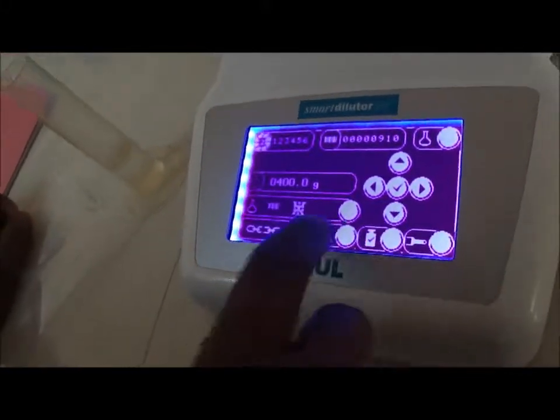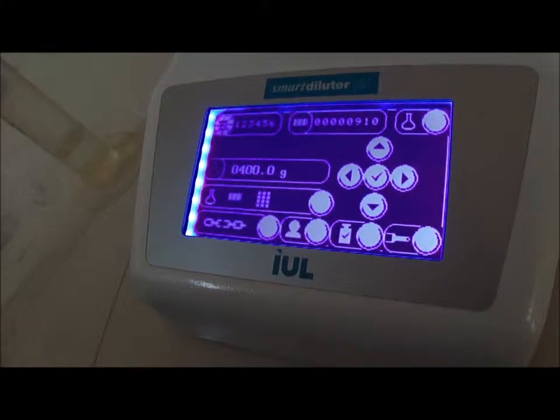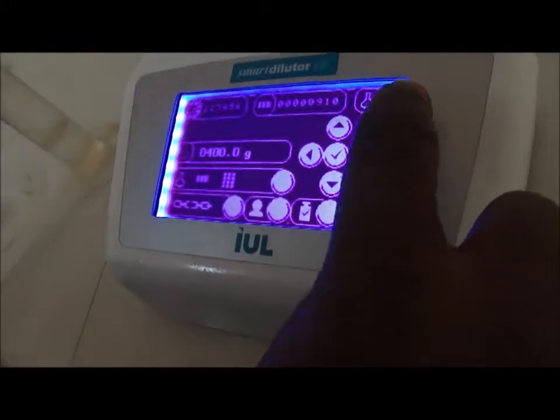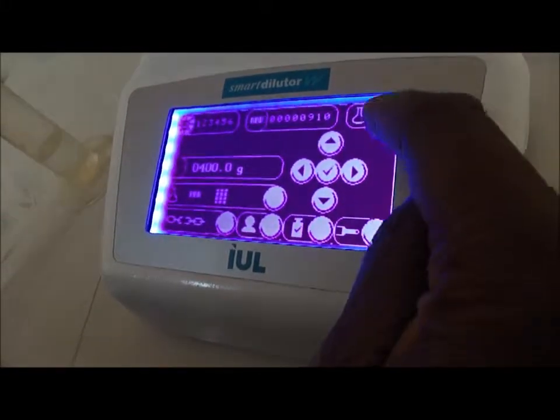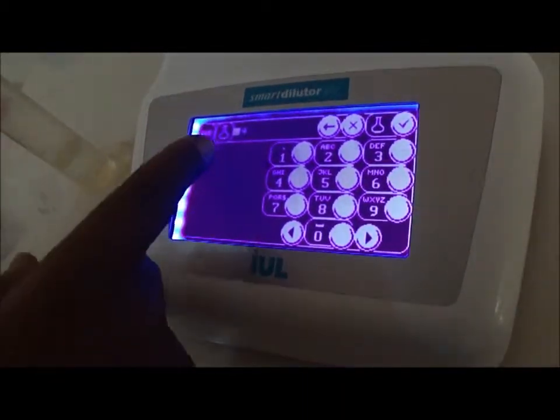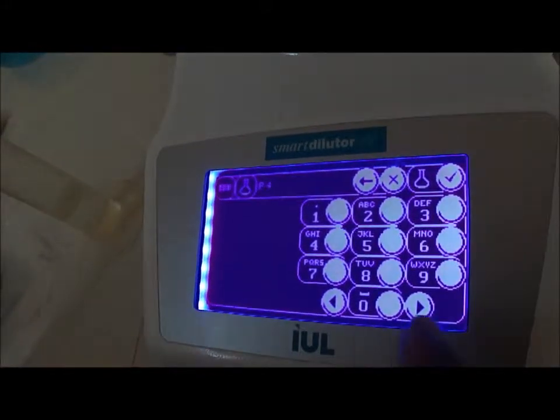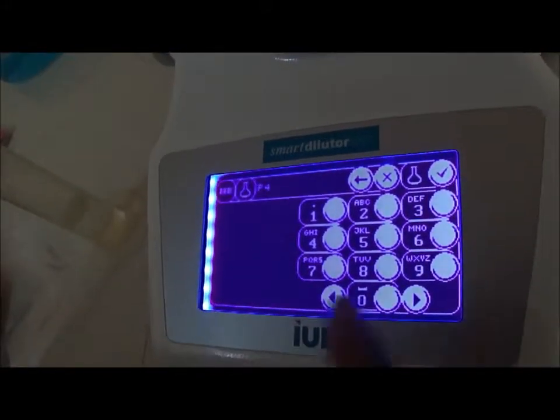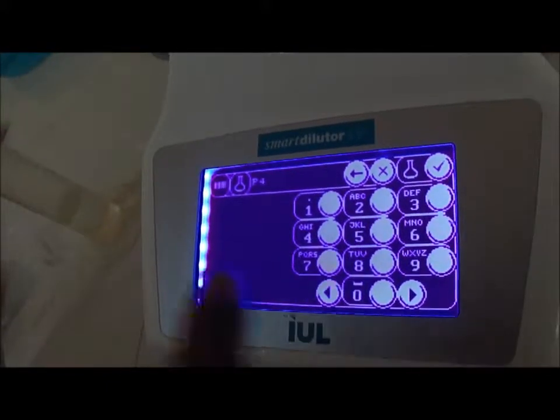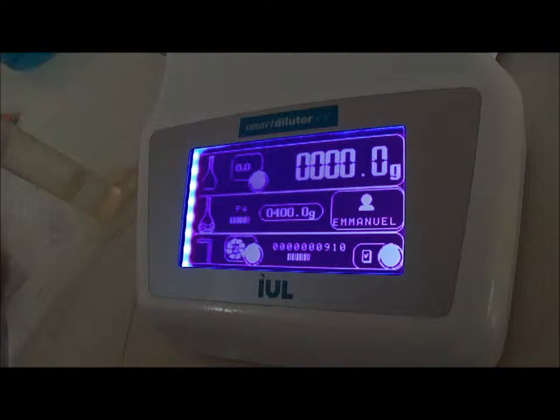Then I move forward by pressing this and uncrossed the keyboard. Now, if I make the turn back, I press the button, then I get the keyboard where I can change. Now it's P4. I could put, for example, P5 or B1 by pressing one of these cables. But let's keep that in this way.